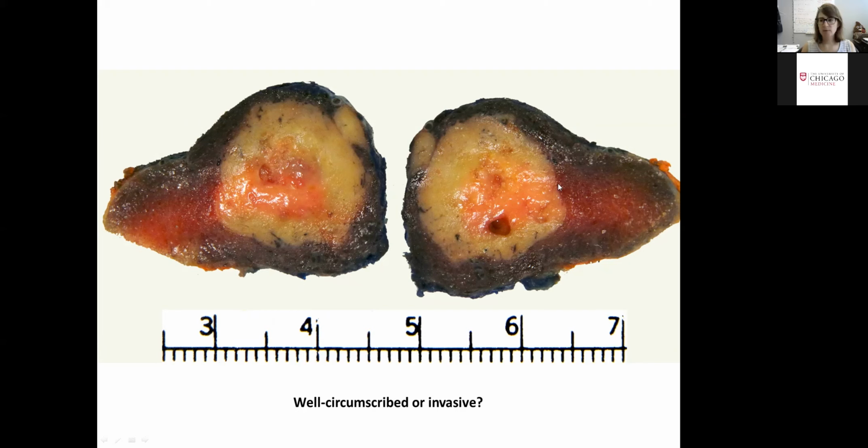Well circumscribed or infiltrative? Now, based on what you know, what already is a little bit worrisome here based on the photograph we already saw? Weird outpouching, infiltrative, satellite, exactly, right? So that satellite nodule there, that weird, funny, undulating border, none of that is okay for a benign nodule.